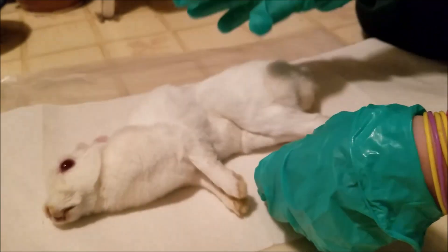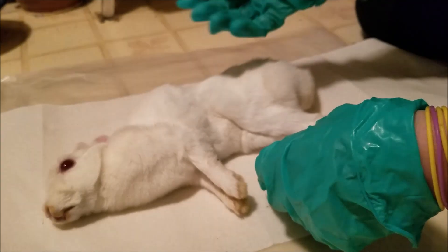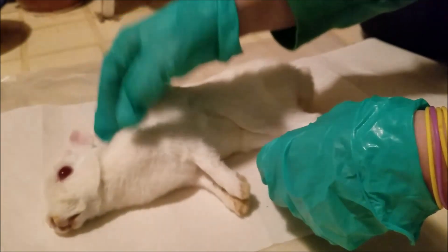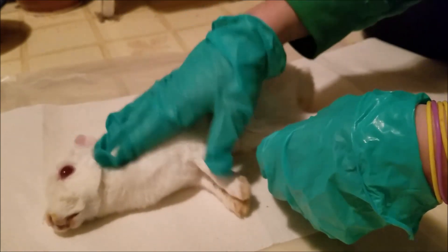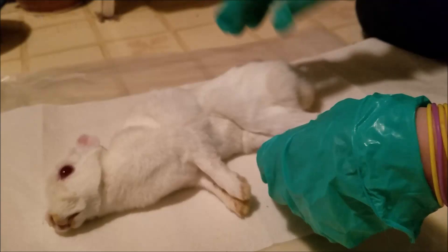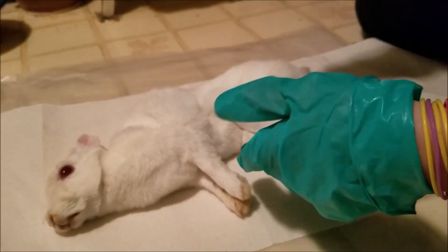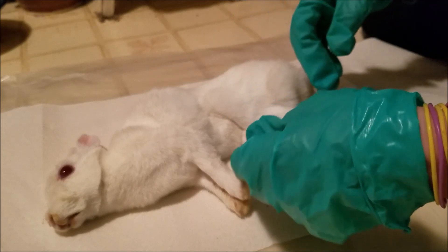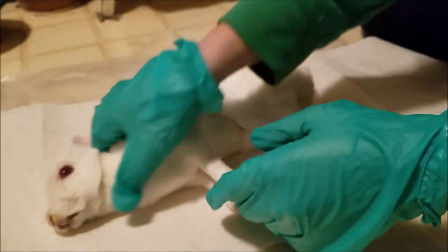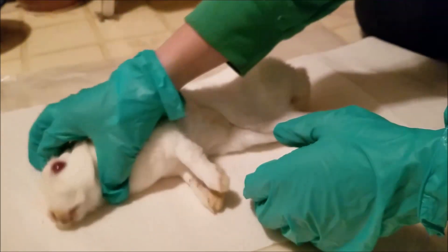First things first, before you even touch the rabbit with the scissors, you need to make sure that it is in fact dead. I usually practice cervical dislocation on ones that are already dead, just to make sure — nothing's worse than getting the rabbit all the way opened up and then finding out its heart was still beating. This rabbit already had the cervical dislocation done, so she is for sure gone.